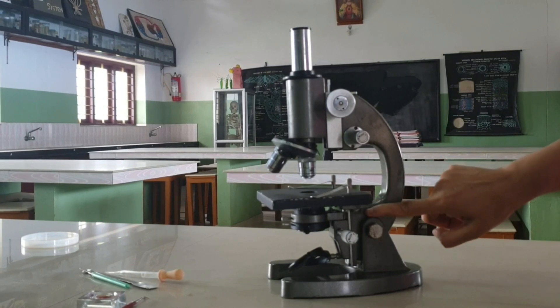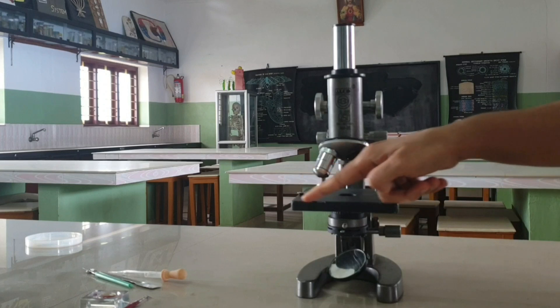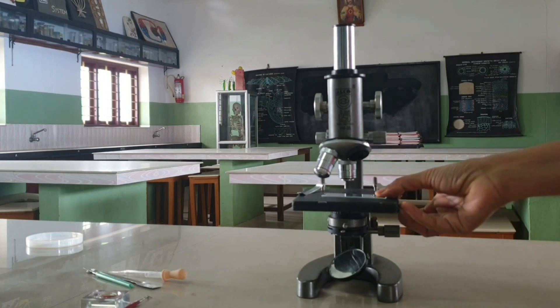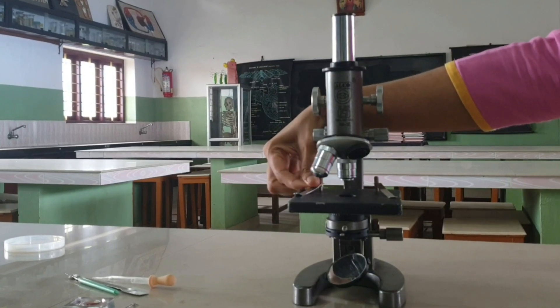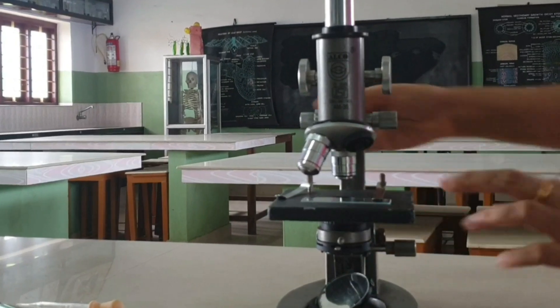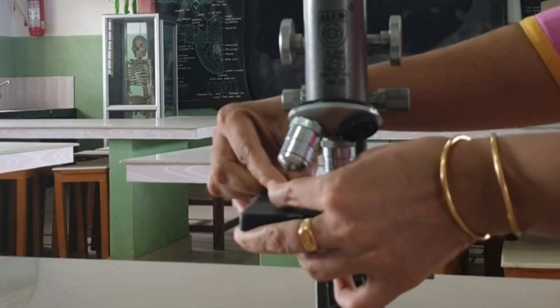Inclination Joint: at this joint, the arm is attached to the pillar. Stage: it is usually a rectangular flat plate attached to the lower end of the arm. It is used for keeping the object whose image is to be magnified. It has a hole in the center for the light rays to pass. Clips: there are two clips attached to the stage, which are used for holding the slide in position.